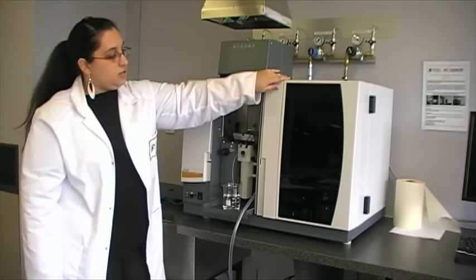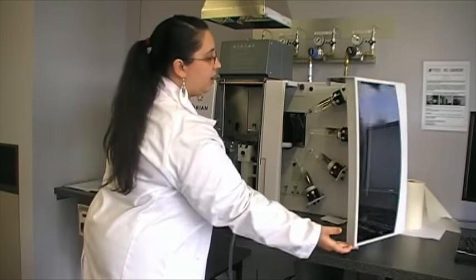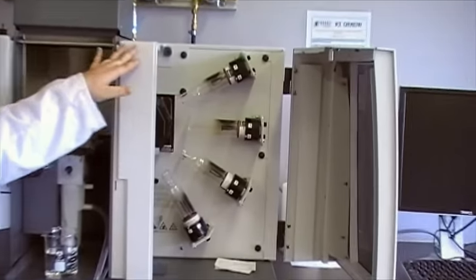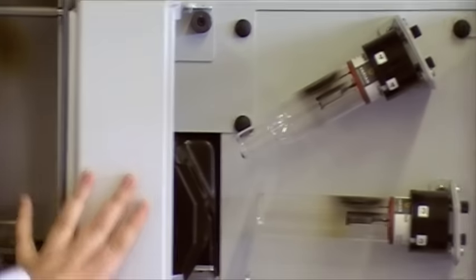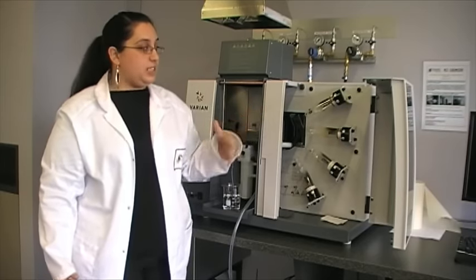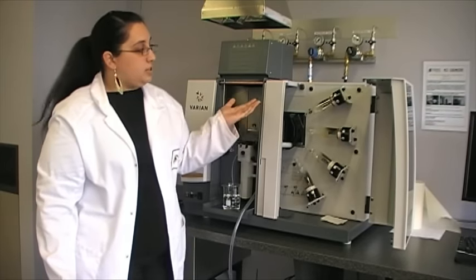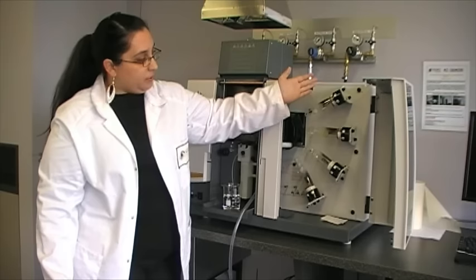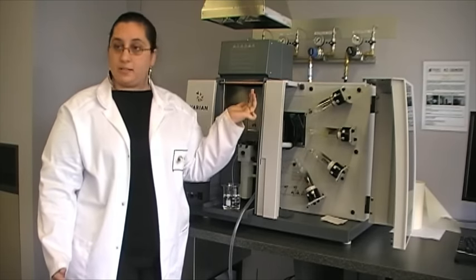Over here in this section of the instrument, we have a range of hollow cathode lamps. Now in your textbooks, you might have seen some instruments and they just have one hollow cathode lamp. The lamp is specific for different elements. So for instance, this top lamp we use for calcium, magnesium or aluminium metals.